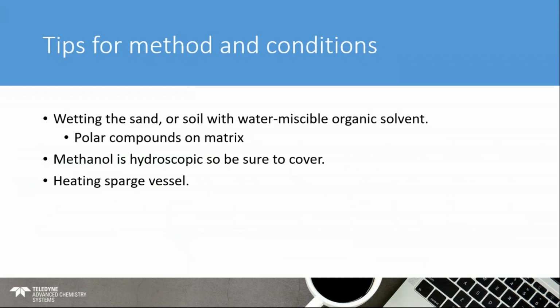Just as a good rule of practice, especially in terms of recovery, wet the sand or soil with methanol prior to analysis. Allowing the analyte time to transition into the methanol can help with recovery, especially with polar compounds that tend to absorb in sand or soil matrices sometimes. For low-level soil samples, sometimes using a heated sparge vessel helps with analyte recovery as well.